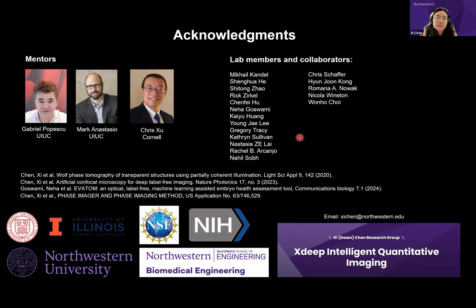I have not tested CQPI on any of this muscle or heart tissue, but it would be very interesting to look at using CQPI, because so far this is a new system. I have only imaged the organoids and the in vivo mouse brain using CQPI. Let's try. So we have, for example, the mouse sinus node, which is only 100, 200 microns in thickness. So we could image it all the way through. It's a fascinating topic. Let's discuss.